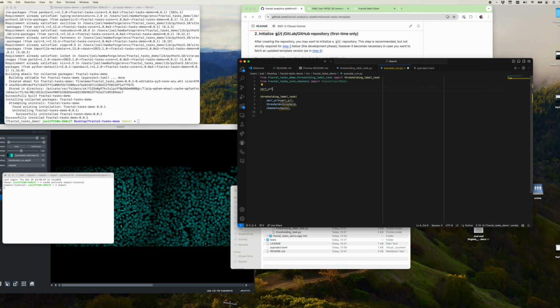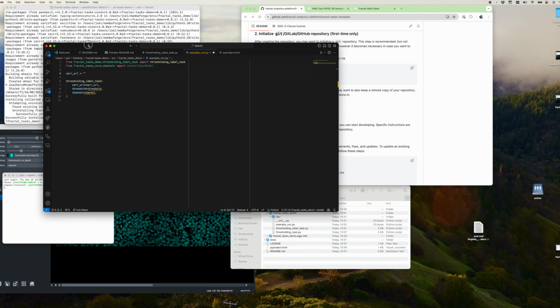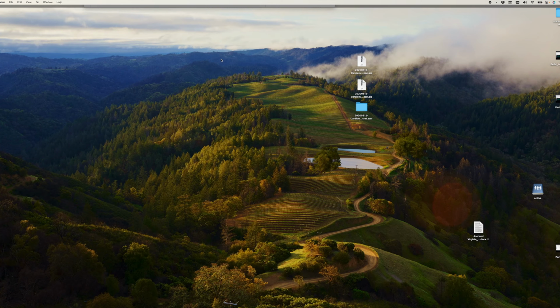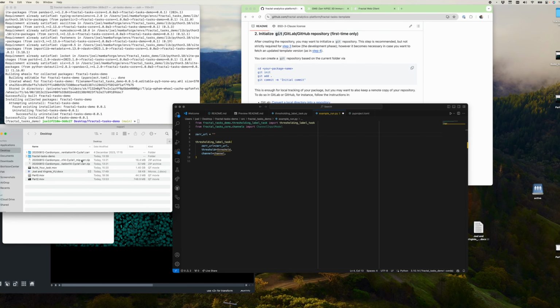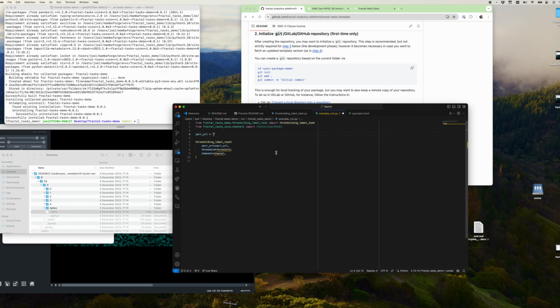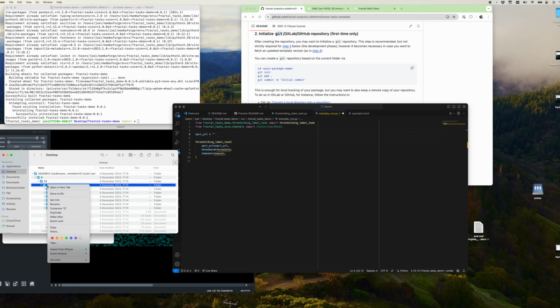The Zarr URL is a string which points to the location of the actual OME-Zarr image. For this purpose, I have an example OME-Zarr file that we can be processing on my desktop here. This is a plate OME-Zarr file. We want to be providing the path to the actual OME-Zarr image, which is the Zarr structure that contains the zattrs attribute with the multiscales metadata. So we get a path to that one.